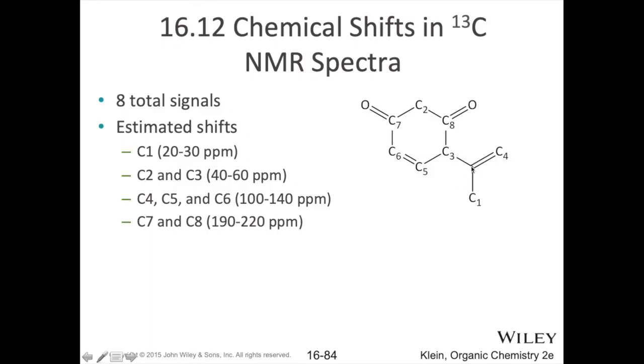They forgot to label this carbon here. There's a 9th carbon that they forgot about. So that's actually going to show up in a similar range to carbons 4, 5, and 6, in that sp2 carbon range of 100 to 150. Carbon 1 over here, this methyl group, is going to show up between 0 and 50.